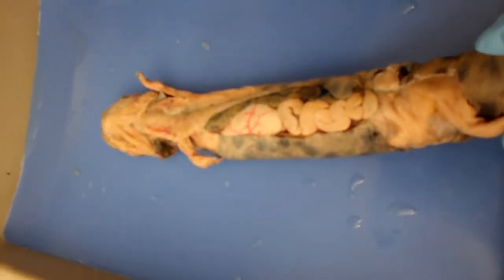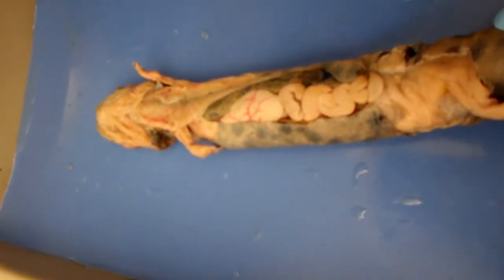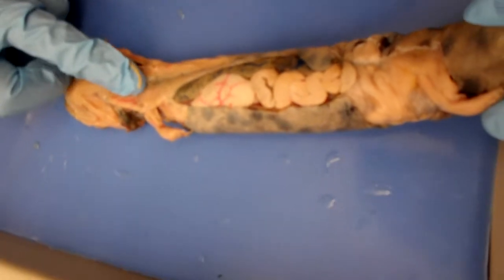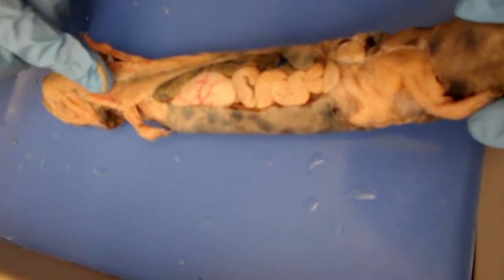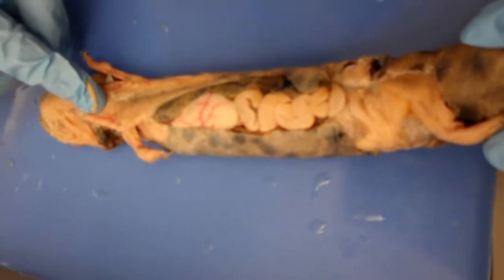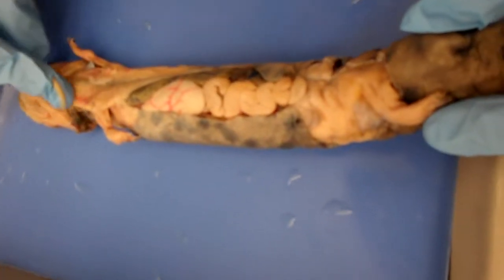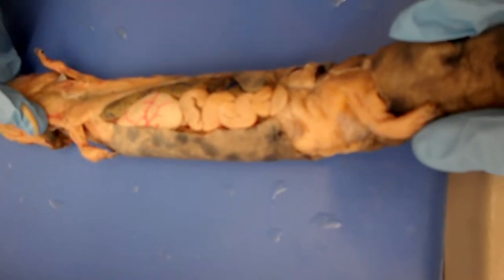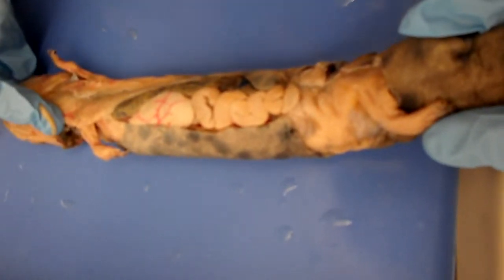And right here is the rectus cervicis. It originates at the rectus abdominis and inserts at the branchial cartilages. Right here is the procoracohumeralis. It originates at the procoracoid and inserts at the humerus.